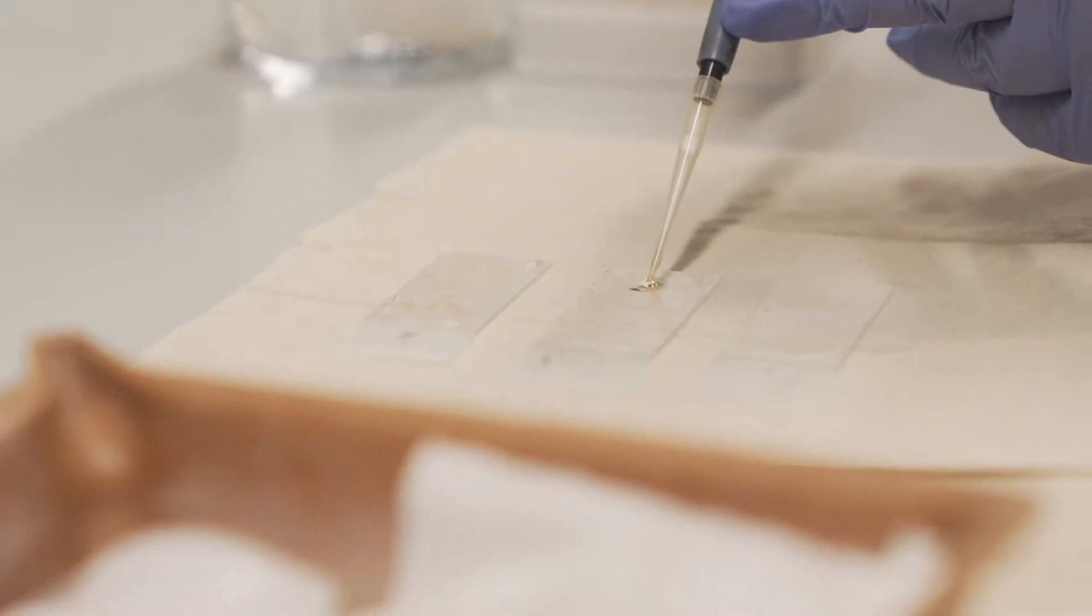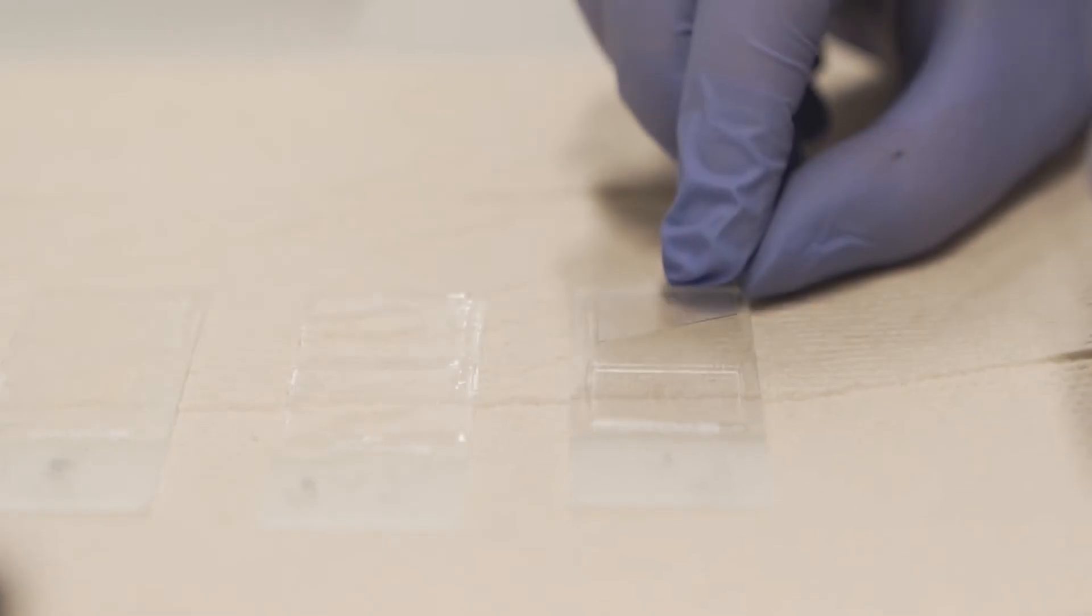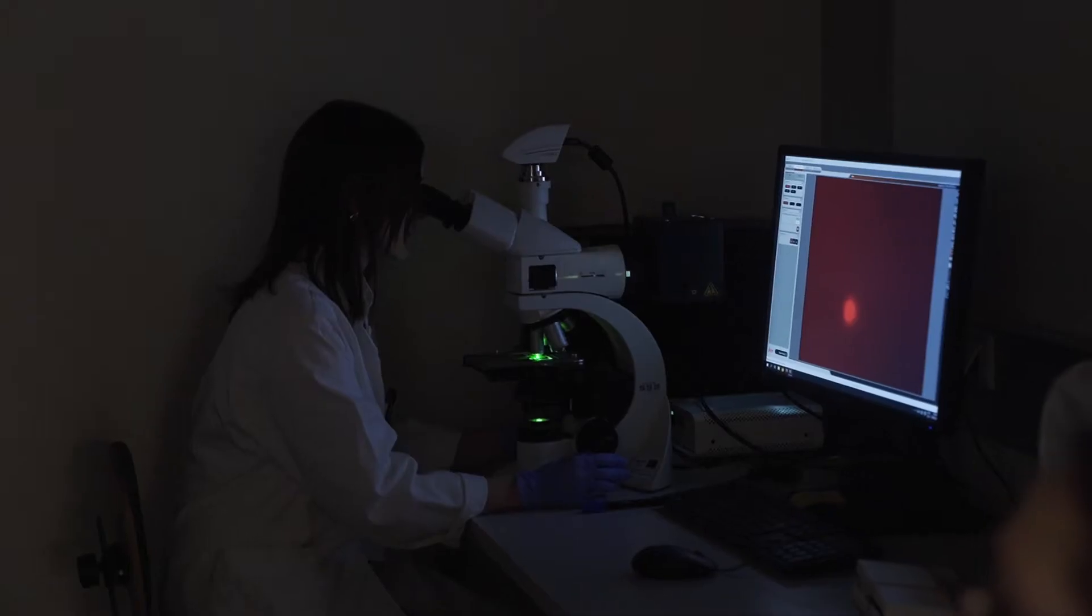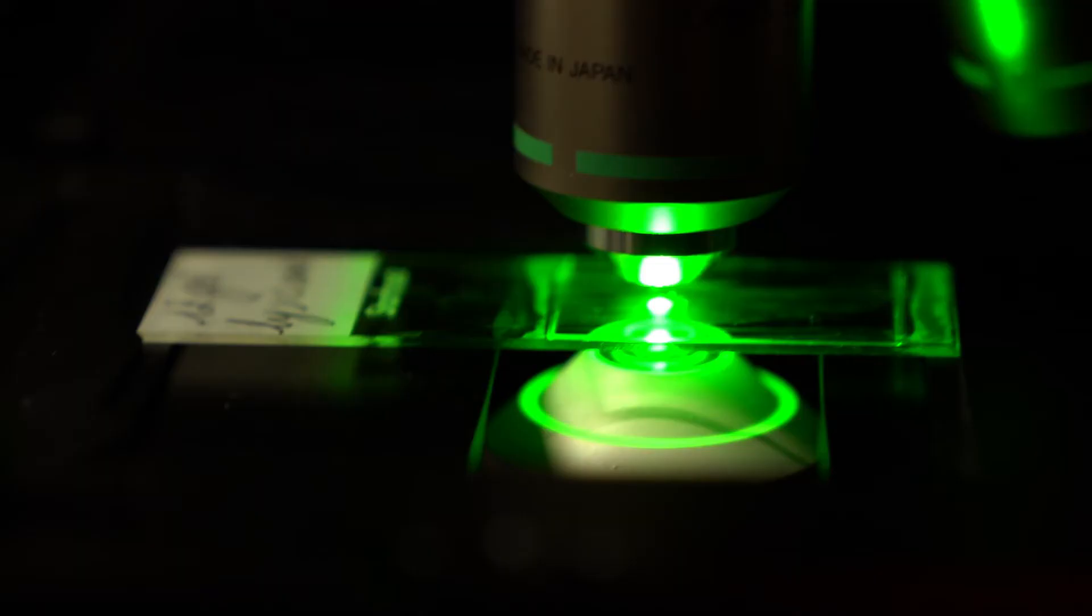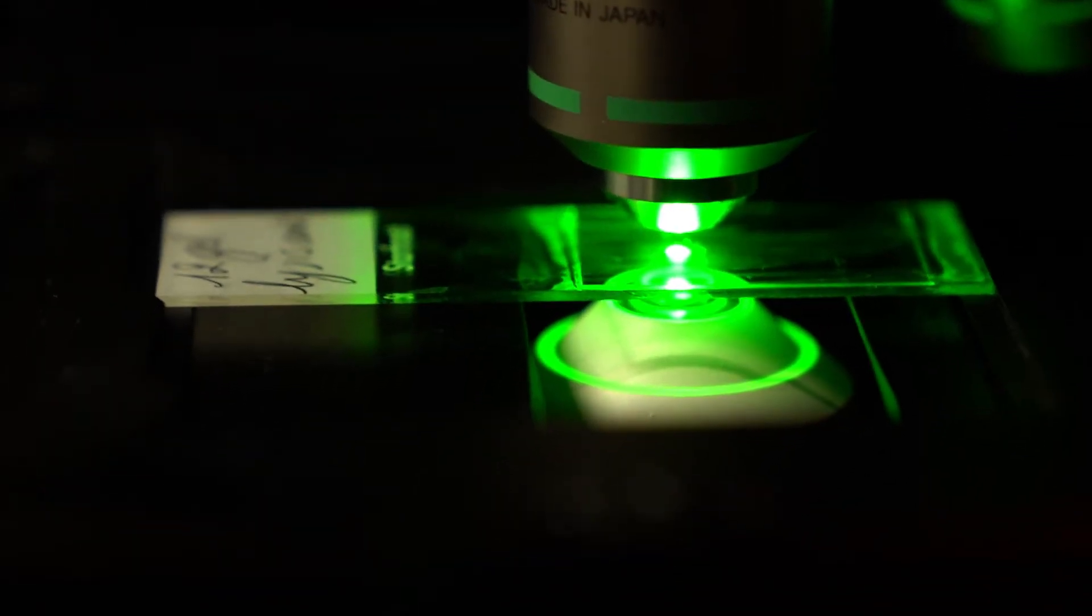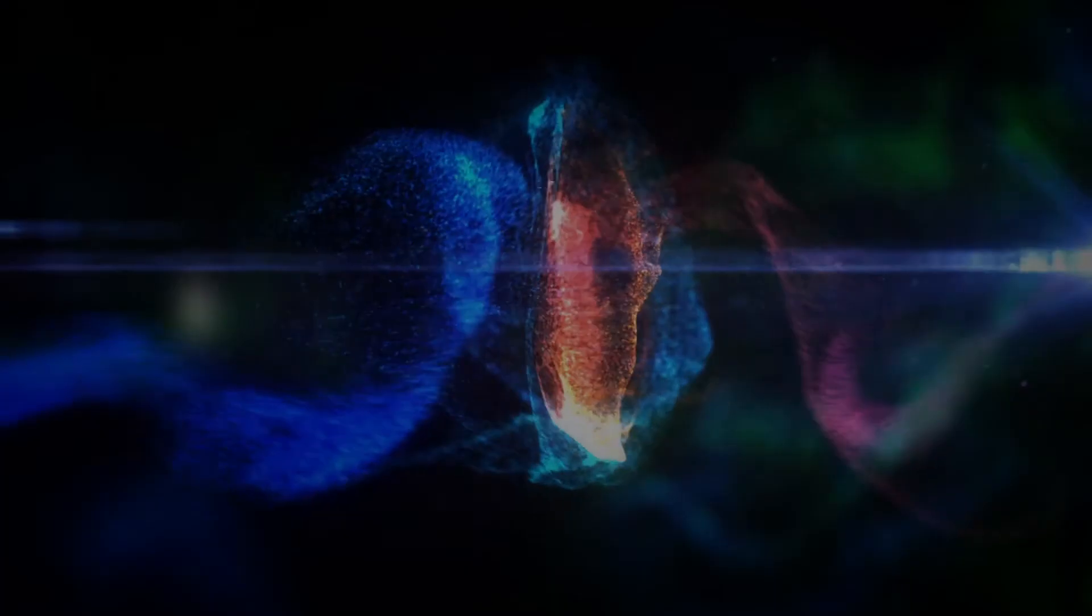To finish the protocol, there are many different dyes that can be used to stain the comets, and there are many different ways to look at the results. You will have to choose the most convenient one for your laboratory.